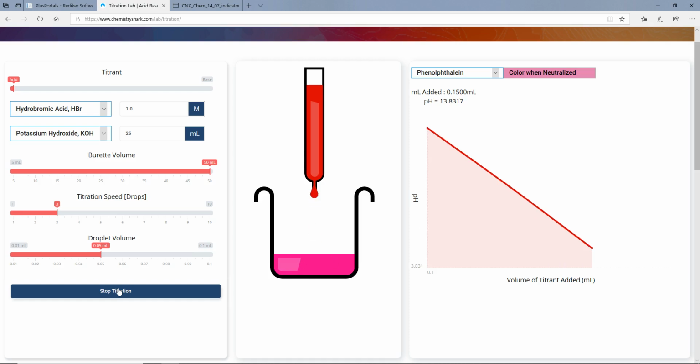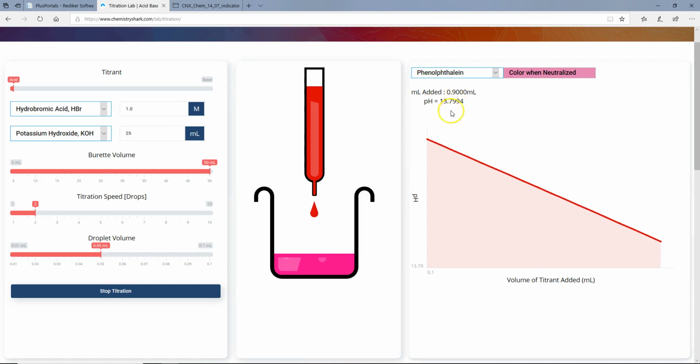And so you're just seeing those drops. Initially, it will be that nice little line, and again, I'm going to slow it down even more. You're going to see just that slope line as it continues to very slowly change this pH. This is another place you could be looking to see about your speed, because again, if you know you've got strong and strong, where are we trying to get to? We're trying to get to about 7.